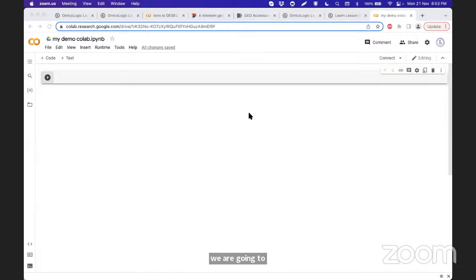So we will discuss what is the data that we are going to analyze today. But before that, we have to start setting up some of the libraries and start installing some of the modules and libraries. So we will let that install and then come back and discuss the data that we are going to focus on today. Okay, looks like, yeah, good, very good, excellent.